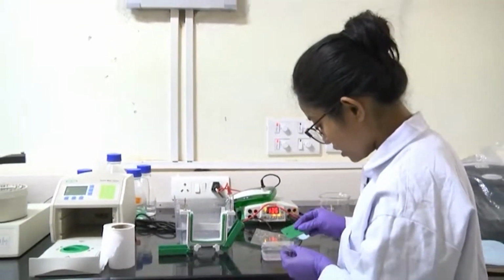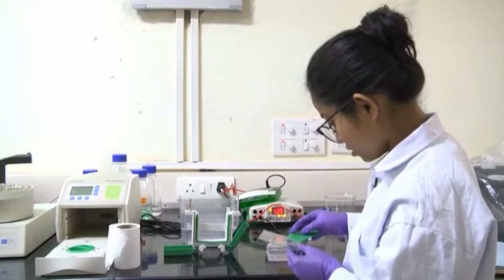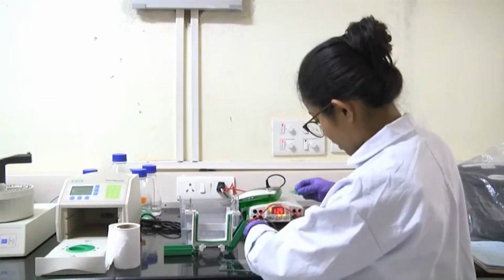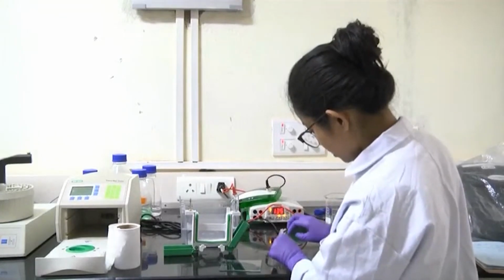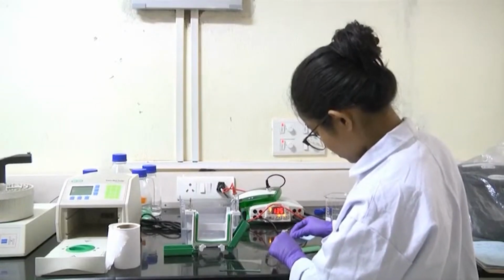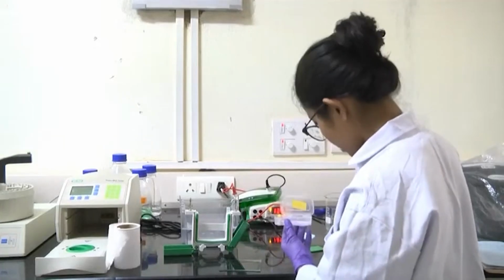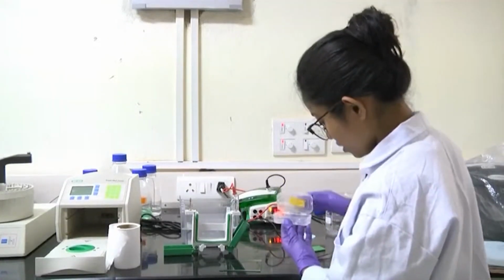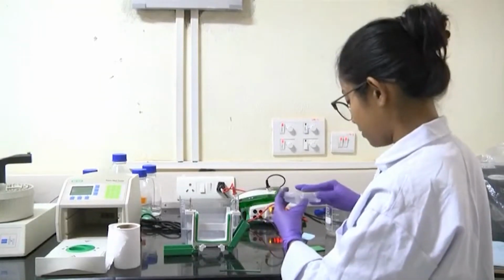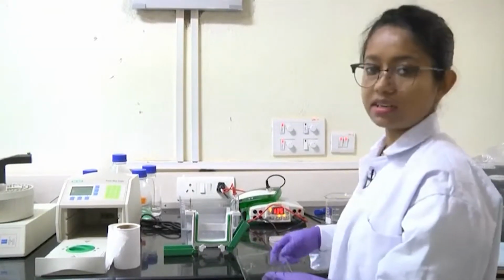I will put this gel in the transfer buffer to equilibrate. This is SDS-PAGE, so you don't need to be very careful; just don't break the gel, and put it in the transfer buffer. We will keep the gel and the membrane in the transfer buffer in a rocking motion for 10 to 15 minutes, so that the membrane and the gel are equilibrated in the transfer buffer.